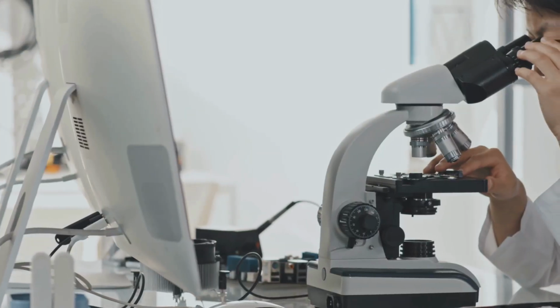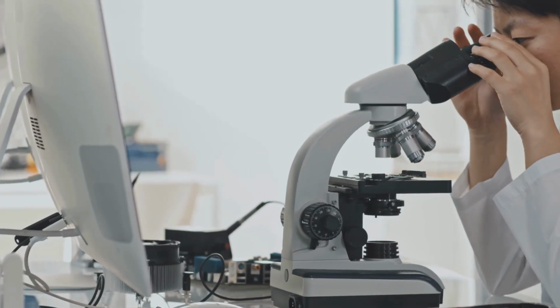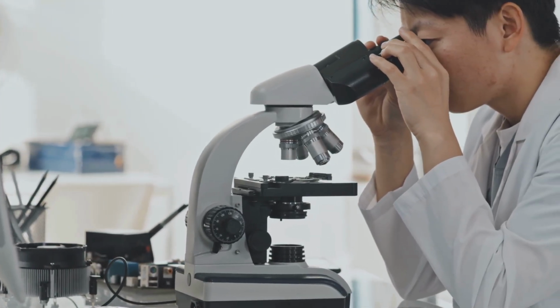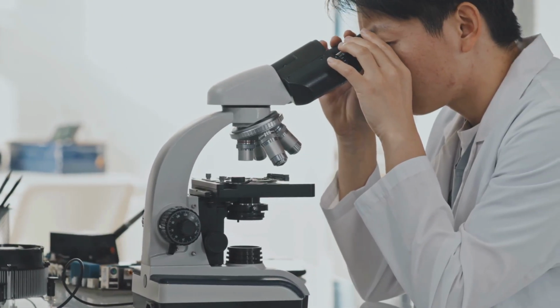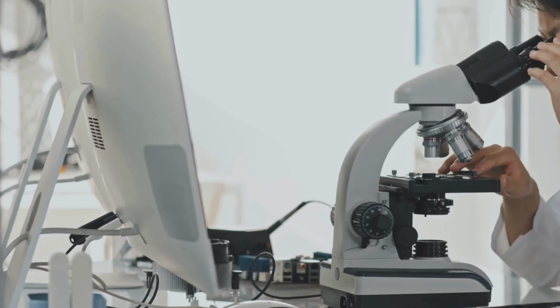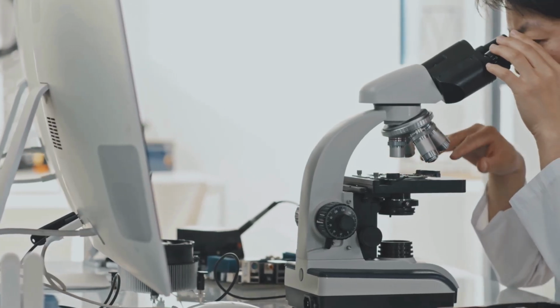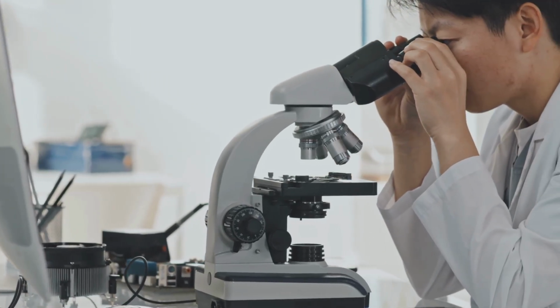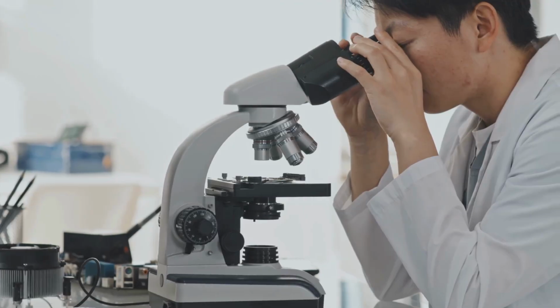The second type is the scanning electron microscope, or SEM. An SEM is like feeling an object with your fingertips in the dark. It scans a focused electron beam across the surface. The beam knocks other electrons loose. Those electrons are collected by a detector. A computer builds a 3D-like image from the signals.